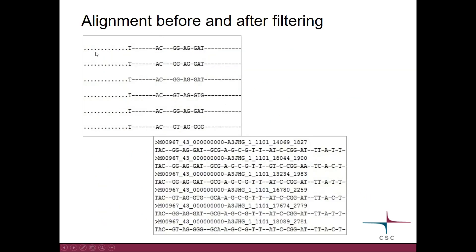Here you can see what the alignment looks like before and after filtering. The dots leading to the first base have disappeared. You can also see that columns which contain only gaps in all the sequences have disappeared — so now T, A, C come next to each other. Also, a gap which previously had three bases has been reduced to two. The alignment has become much more compact.